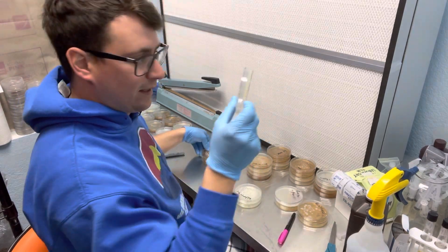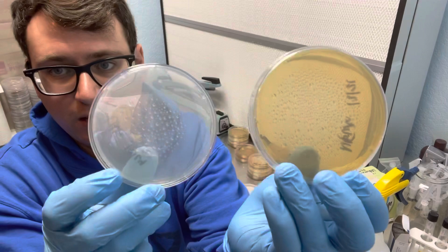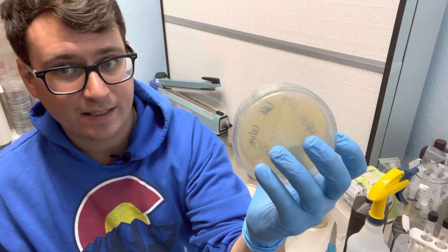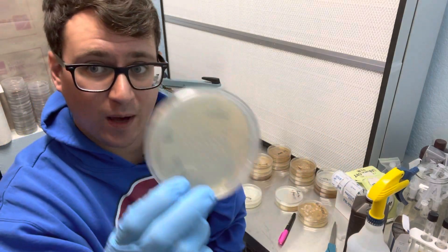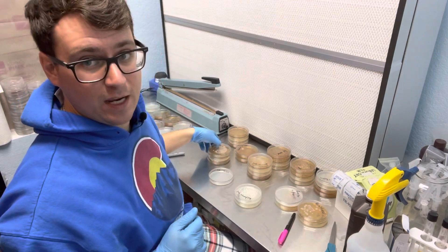We've got the lion's mane next. Looks like we're still waiting on these ones, but it's good because then I know that there's no bacterial contamination — clean plates five days in. It's a pretty good indication that whatever pops, whenever these spores pop, it will be pure lion's mane mycelium. So I'll just be patient with those ones.